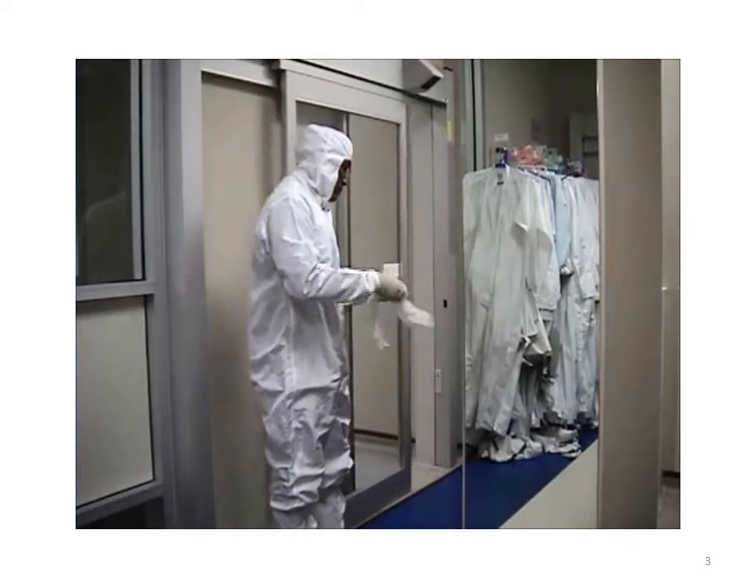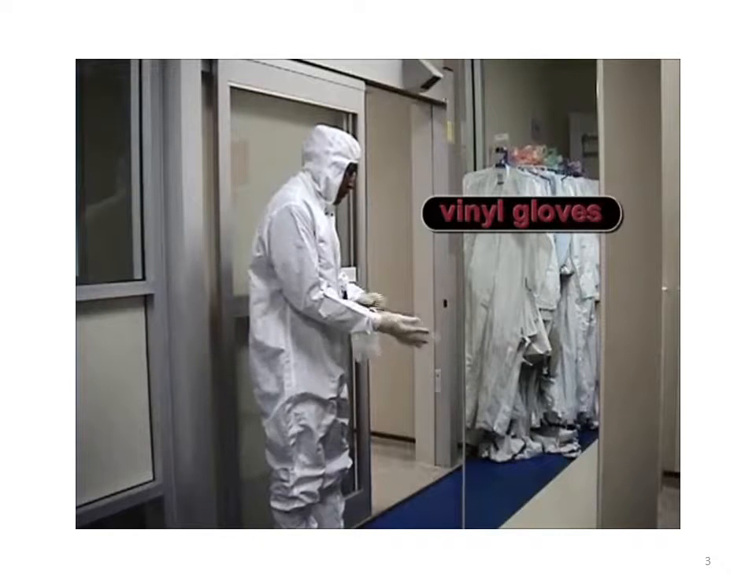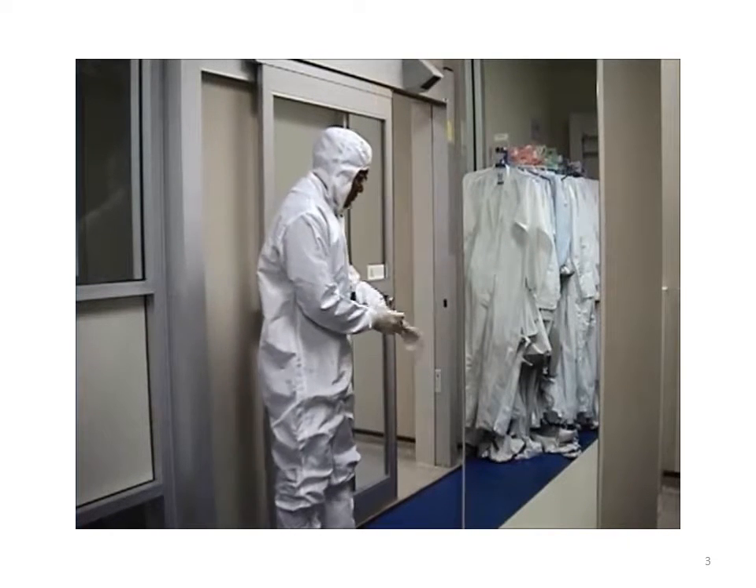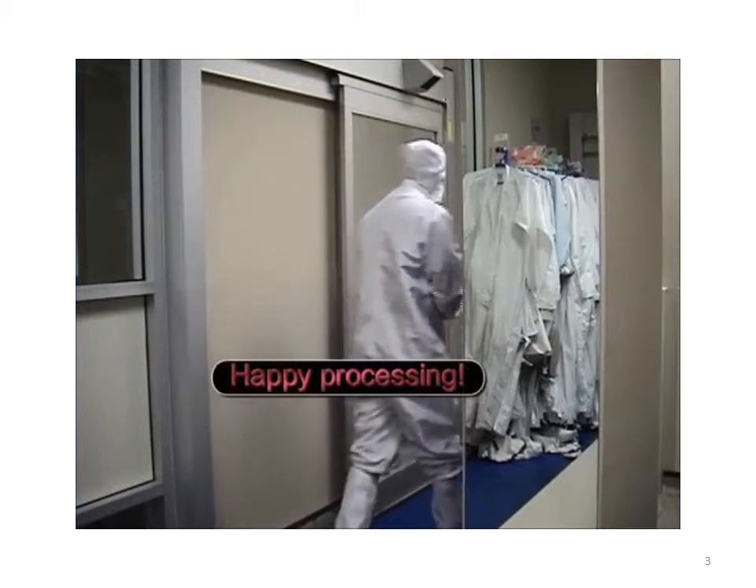Last thing, put on a pair of vinyl gloves. You are now ready to enter the clean room.